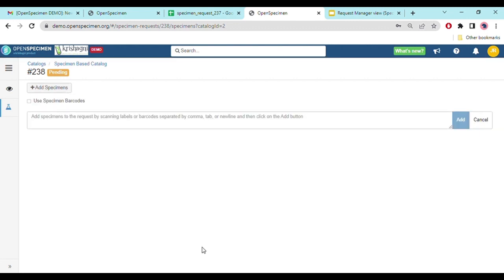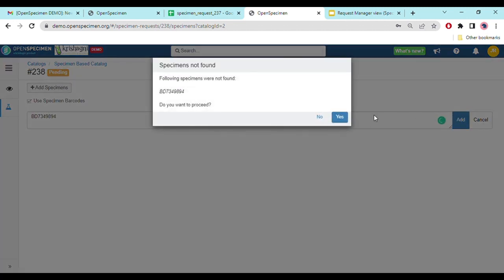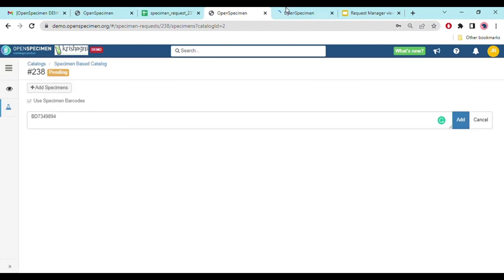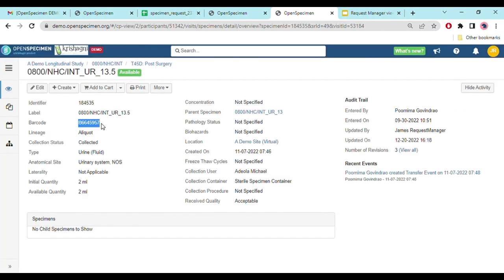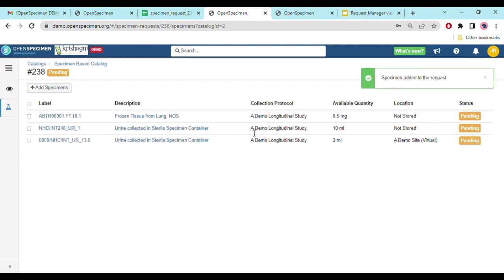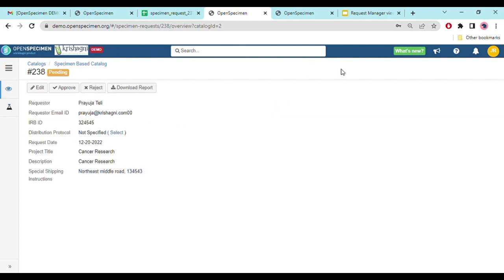To add a specimen using a barcode, click 'Add Specimens' and make sure the 'Use Specimen Barcodes' option is checked. I'll enable it and put in the barcode. If a sample is not found it means it's not available in the study. Once I find the correct barcode and paste it, you can see the specimen is added to the request along with its description. All columns shown are configurable using query modules.